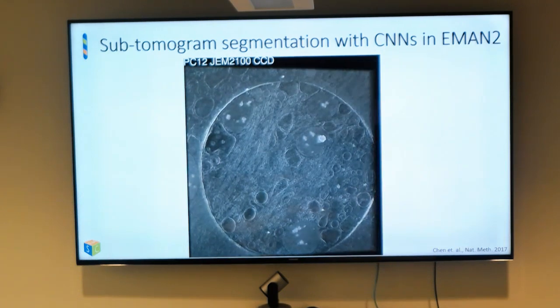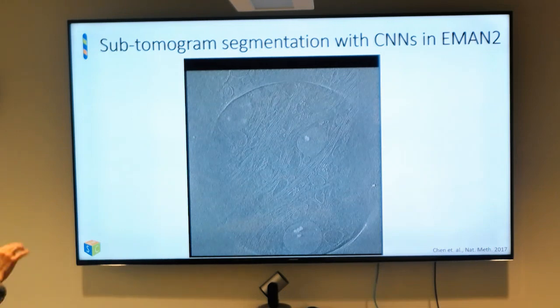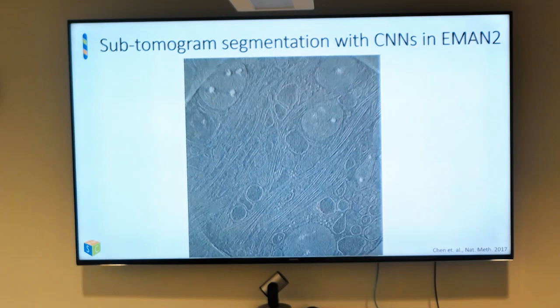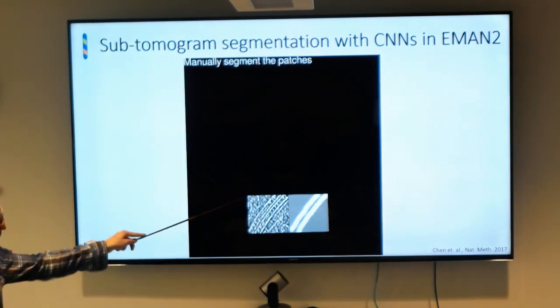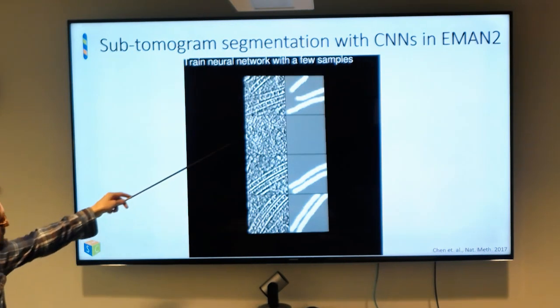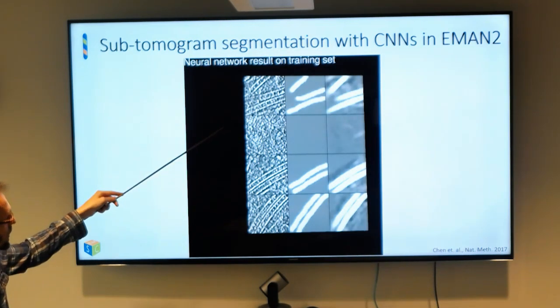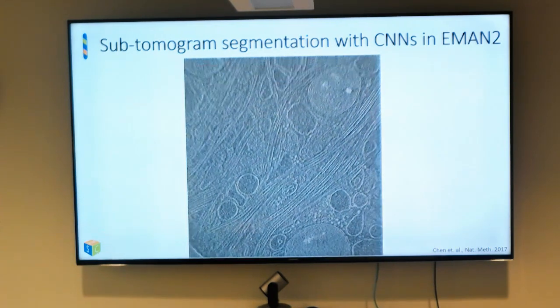So it's great for visualization, and I think you're able to use these coordinates that the neural network outputs, maybe do some extraction based on those. And they do have geometric parameters, so you should be able to. All it's showing here is, take this, sit down and just draw those two lines. That's part of your input, and then you give it a few of these lines as input and one or multiple negatives for output. And that's what it decided to pick after it trained.